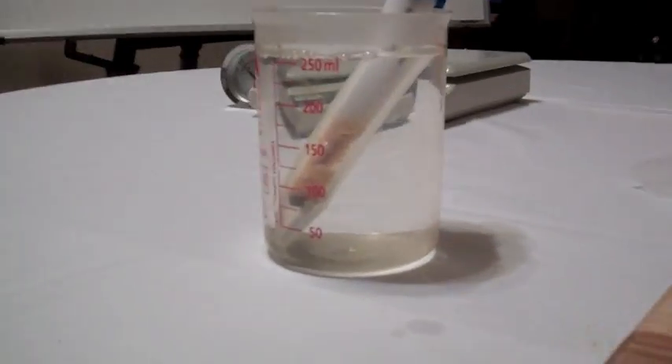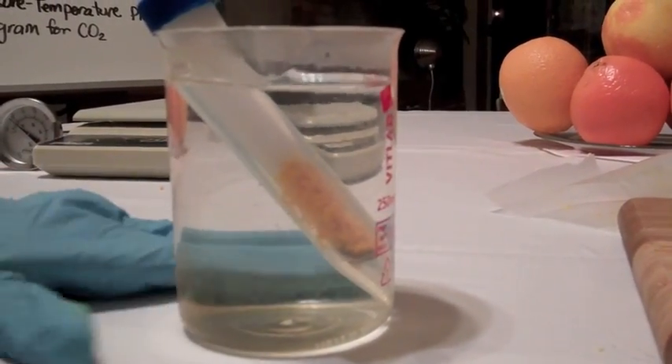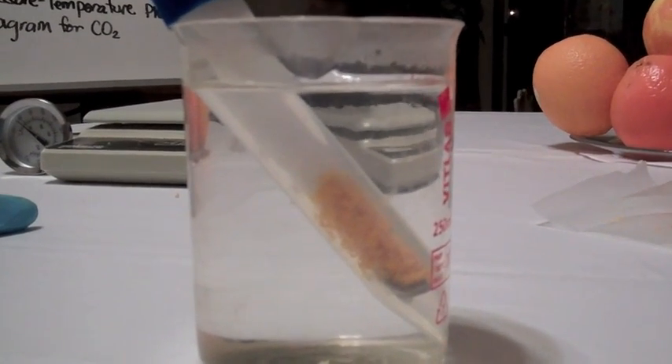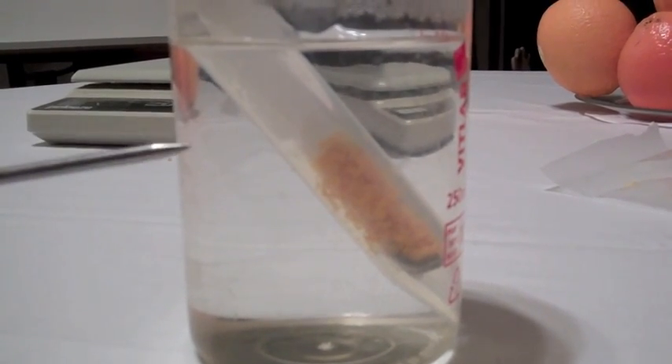I really do find that 98 degrees Celsius works best. The reaction should start to go in roughly 20 to 30 seconds. There it goes — you can see the ice starting to melt, and then it starts to percolate. It's now liquefying.